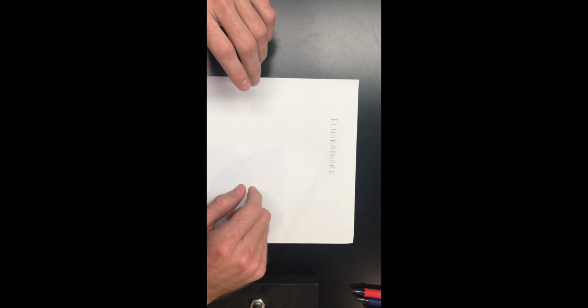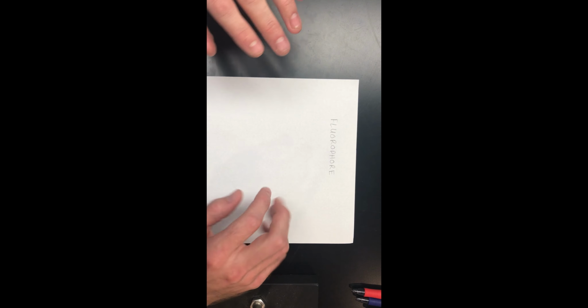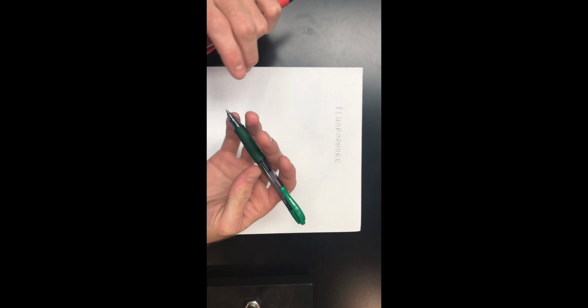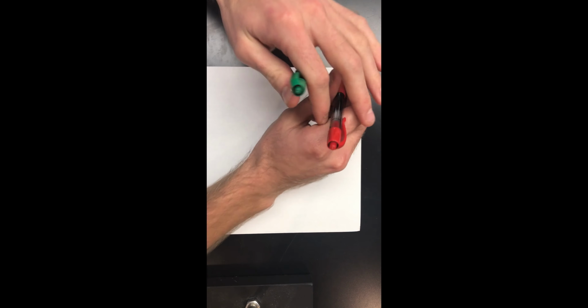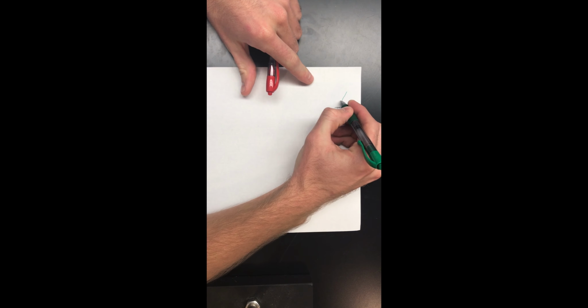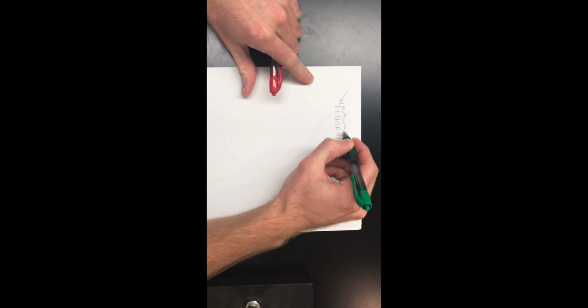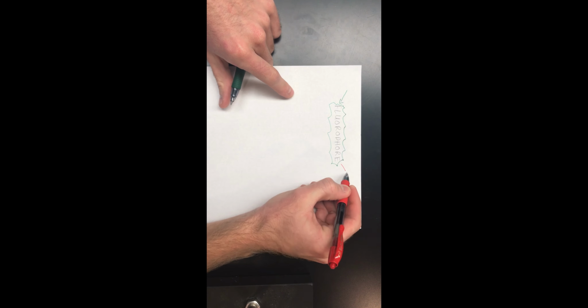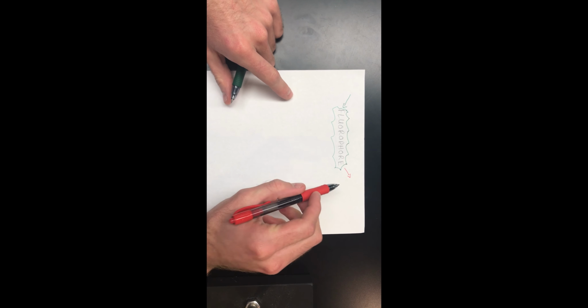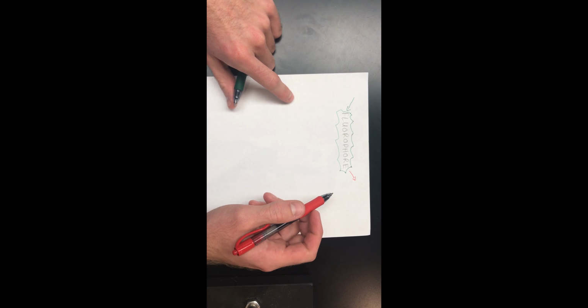A fluorophore is a fluorescent chemical compound that can emit light upon excitation with light. When we excite a fluorophore with a certain wavelength of light, it's going to emit light at a longer wavelength. So we're exciting with this wavelength, and the fluorophore is emitting with a longer wavelength of light.